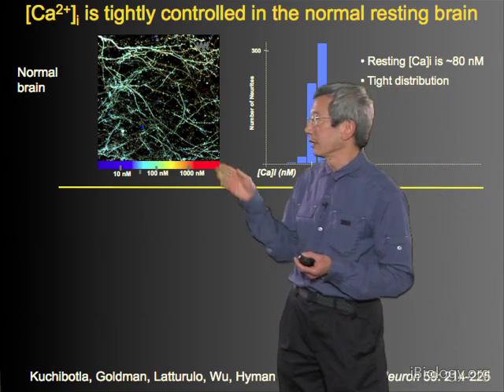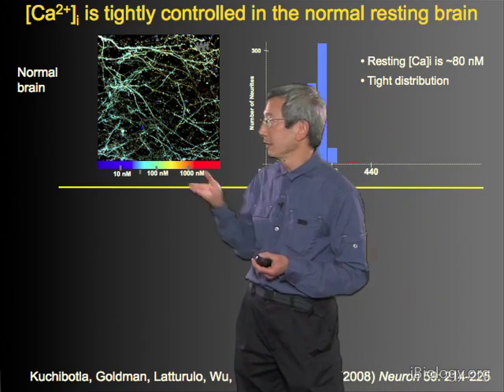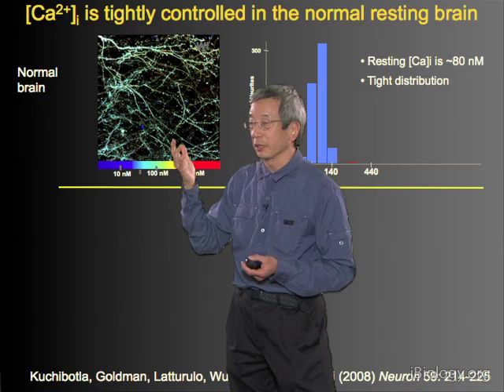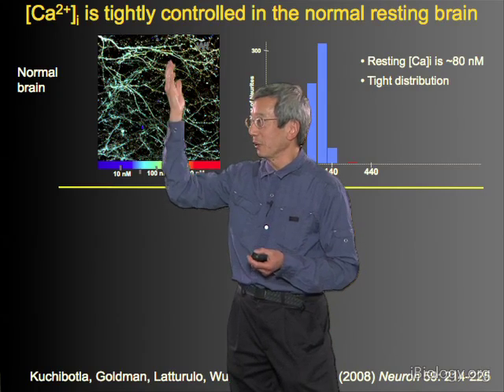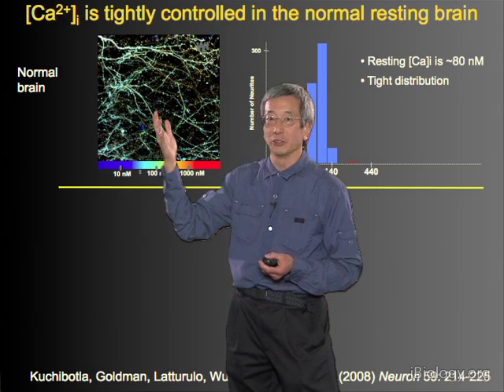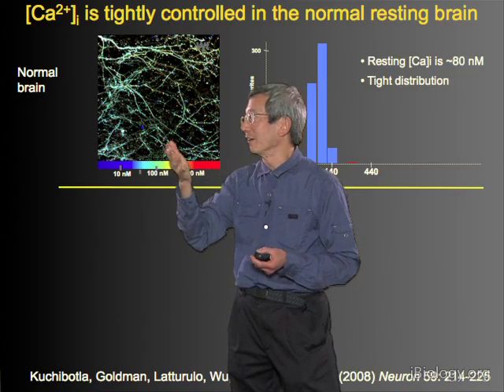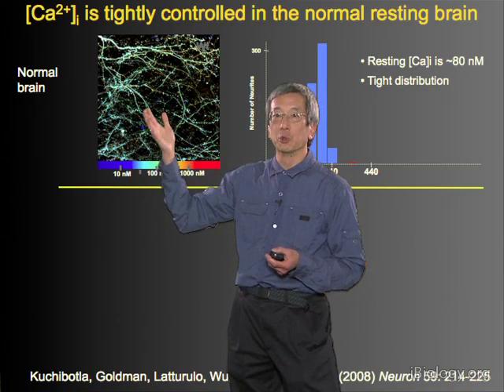And this was work on the effects of Alzheimer's protein, the famous A beta, being misregulated and expressed. Now first we have here a normal brain. This is actual in vivo microscopy in the intact brain. It's lightly labeled. You don't see all of the different dendrites and axons because the genetics only cause maybe 1 in 100 or 1 in 1,000 cells to express, but we can see these tree trunks and roots of the different neurons, and they're all pretty much a uniform blue-green pseudo-color.